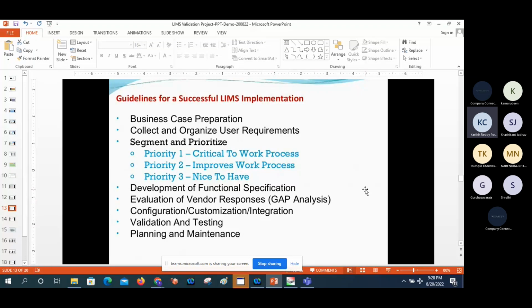Vendor can do the configuration testing. The configuration they can fix, then they can deliver it to the LIMS core team. LIMS core team people can do the configuration testing again. Once everything is fine, they can fix the particular workflow. The same thing can be tested in the quality environment. Then we can deliver the system to production for the end user.